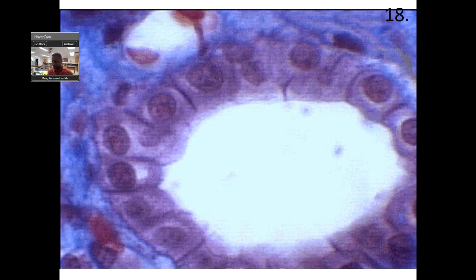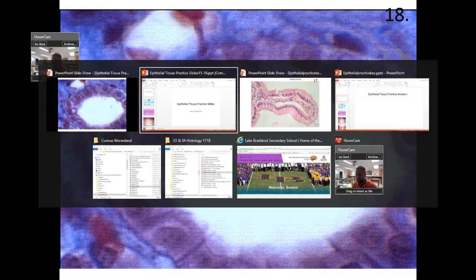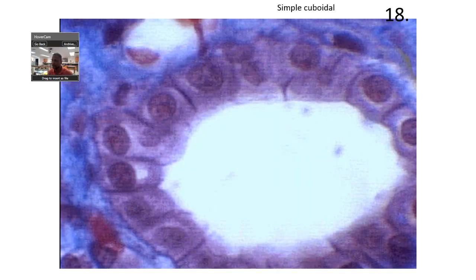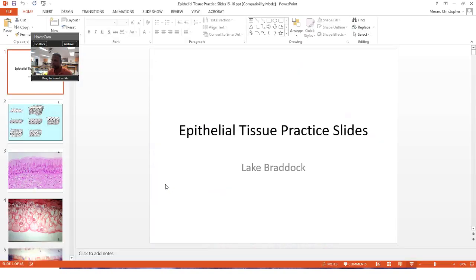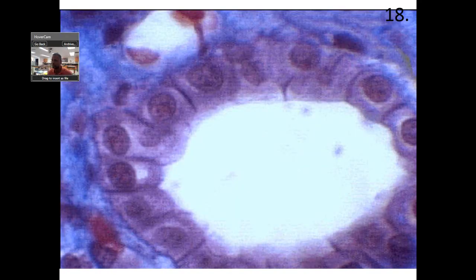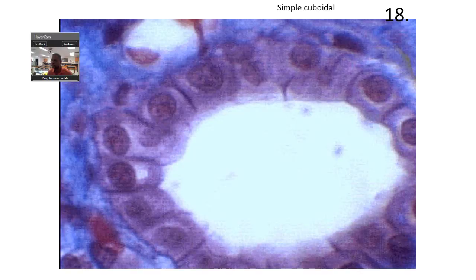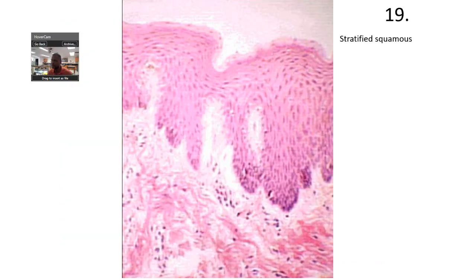Number 18 is going to be cuboidal. And then stratified squamous again.